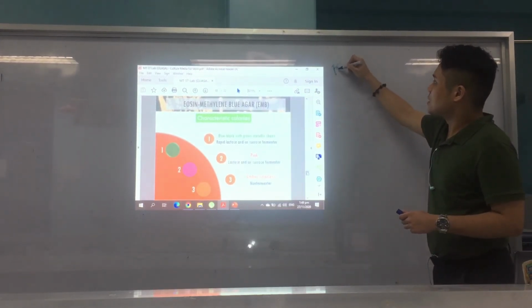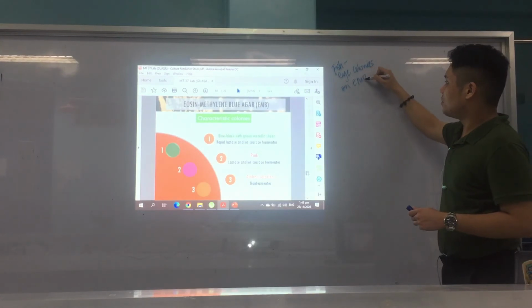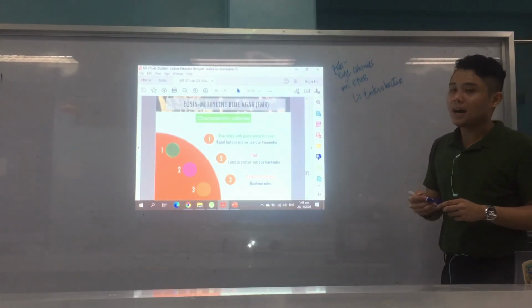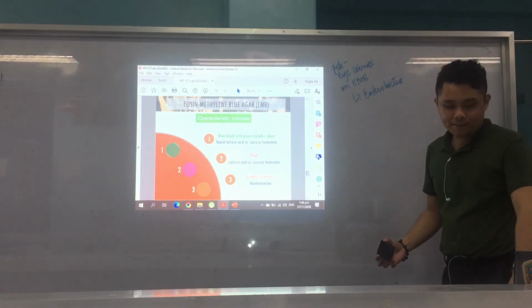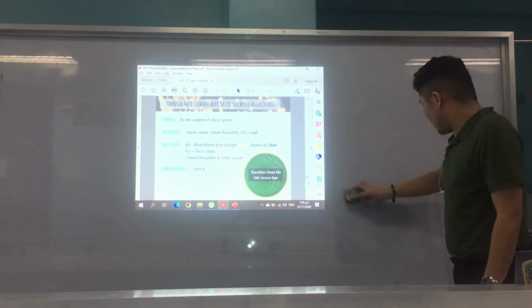Alright. And another one is also fish eye colonies. Fish eye colonies, like the eye of a fish. On EMB, who is this? Please take note, this is Enterobacter. Okay? Characteristic. Enterobacter, fish eye colonies. So it's like the eye of a fish. Okay? Alright.